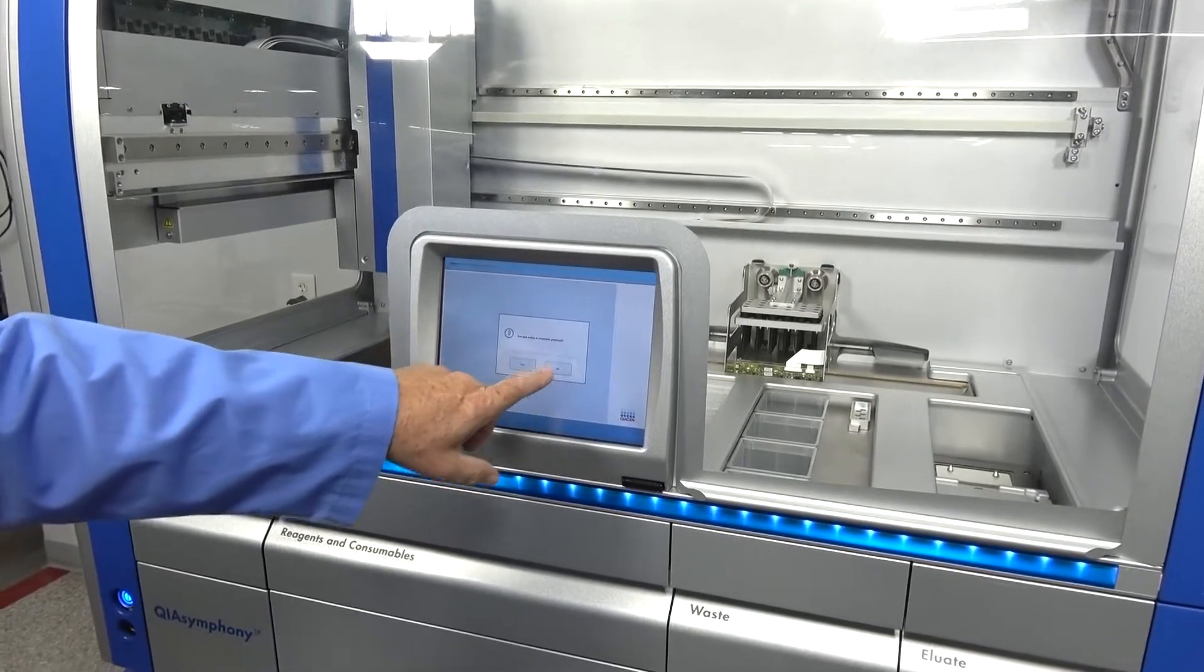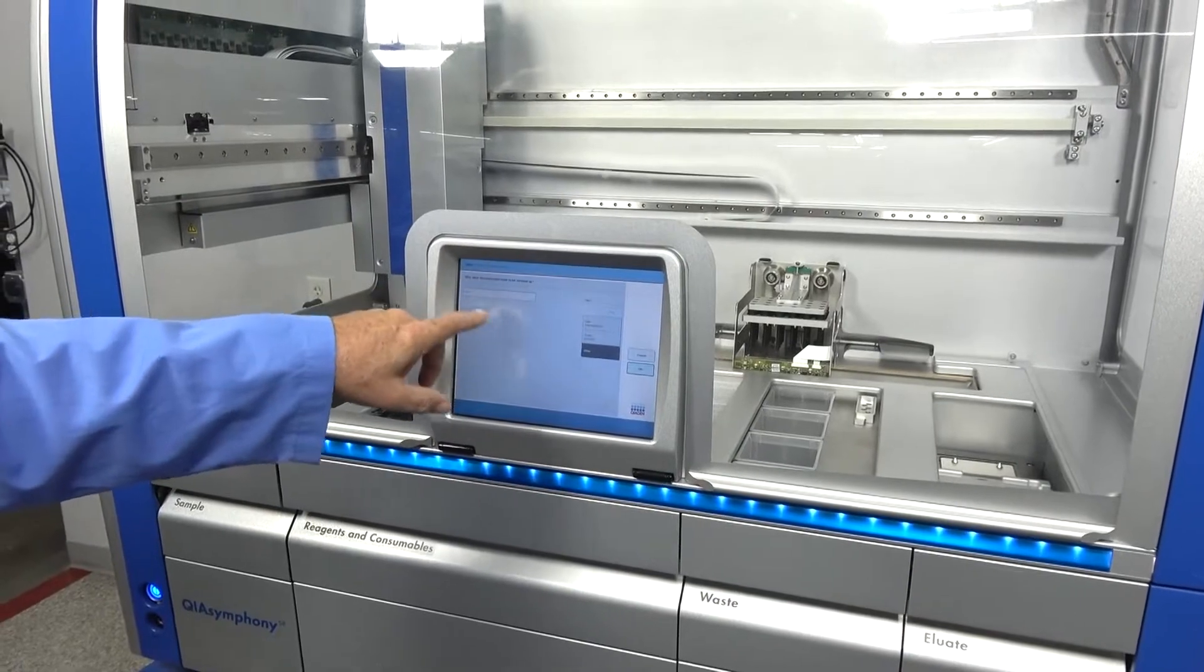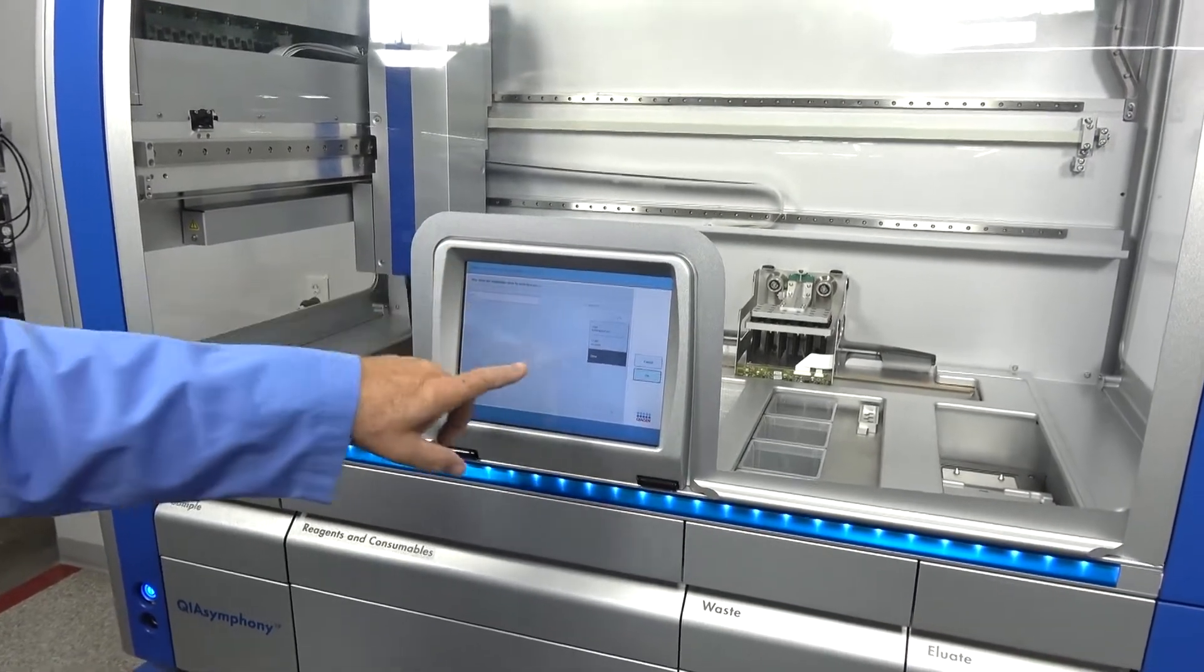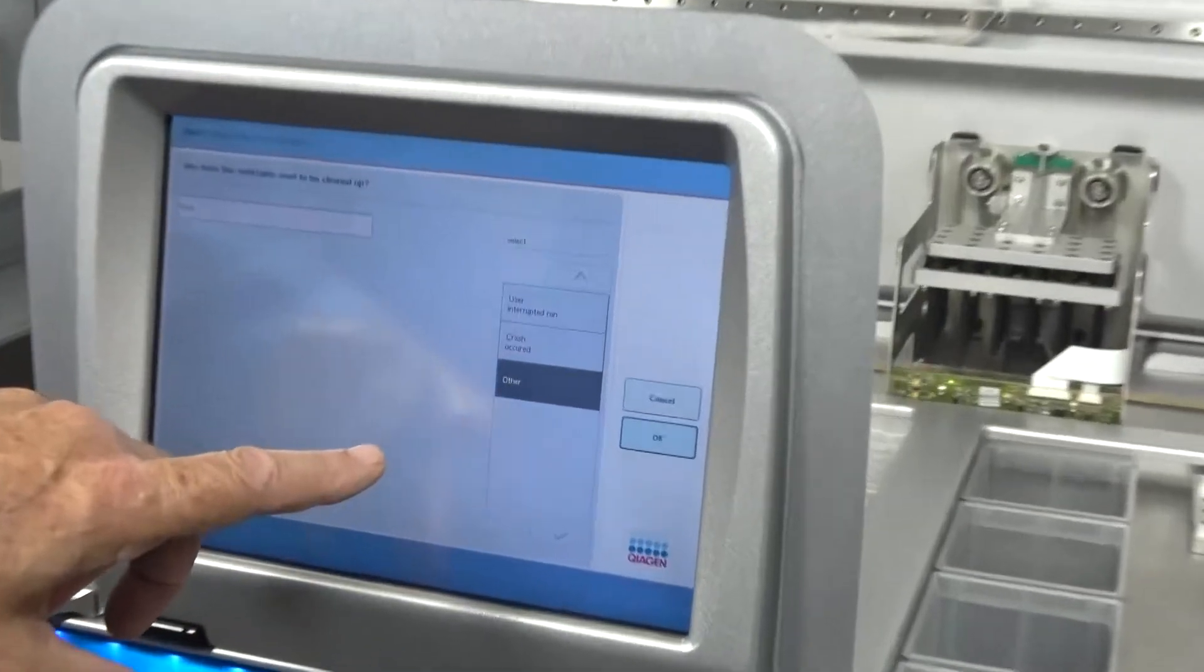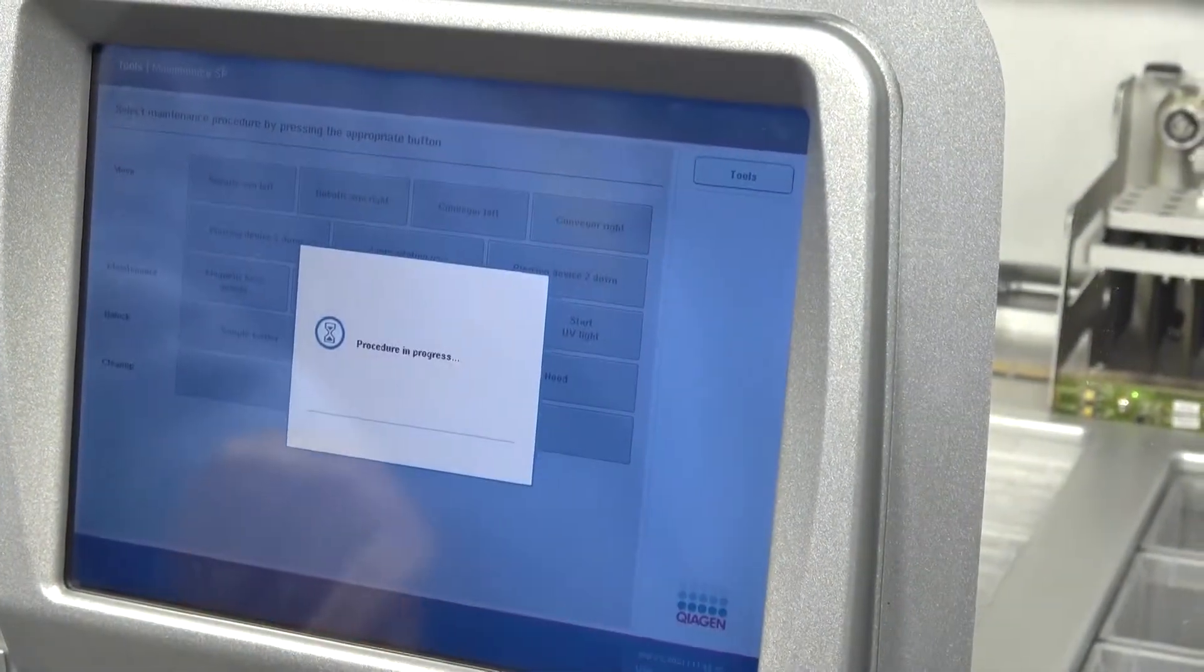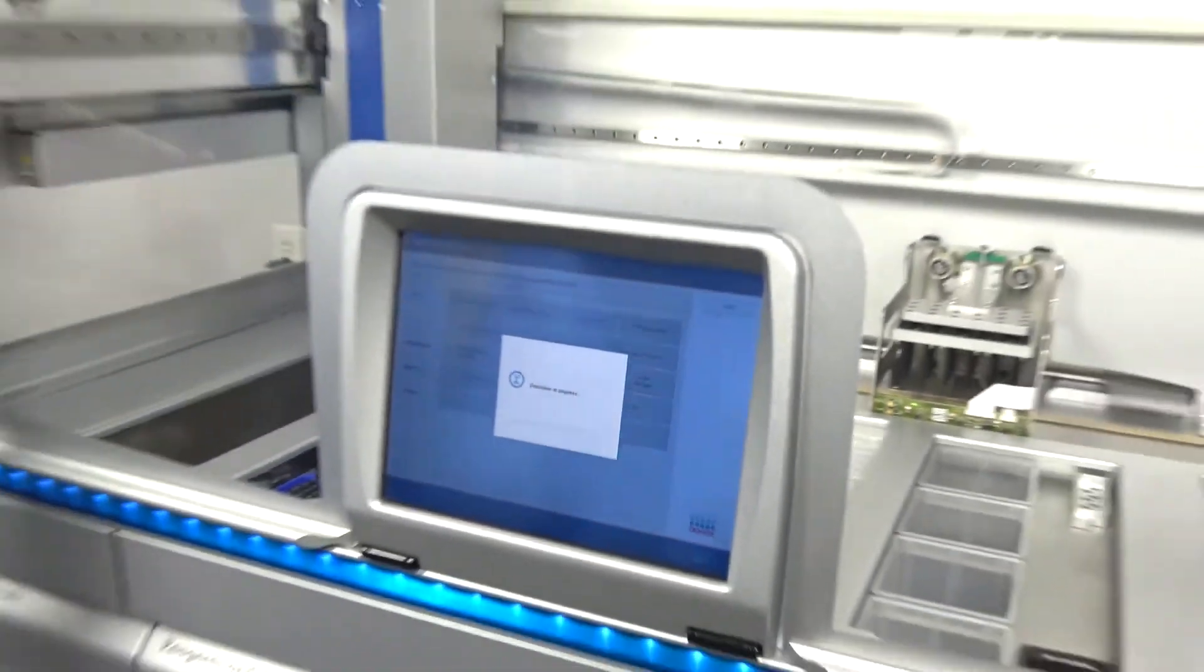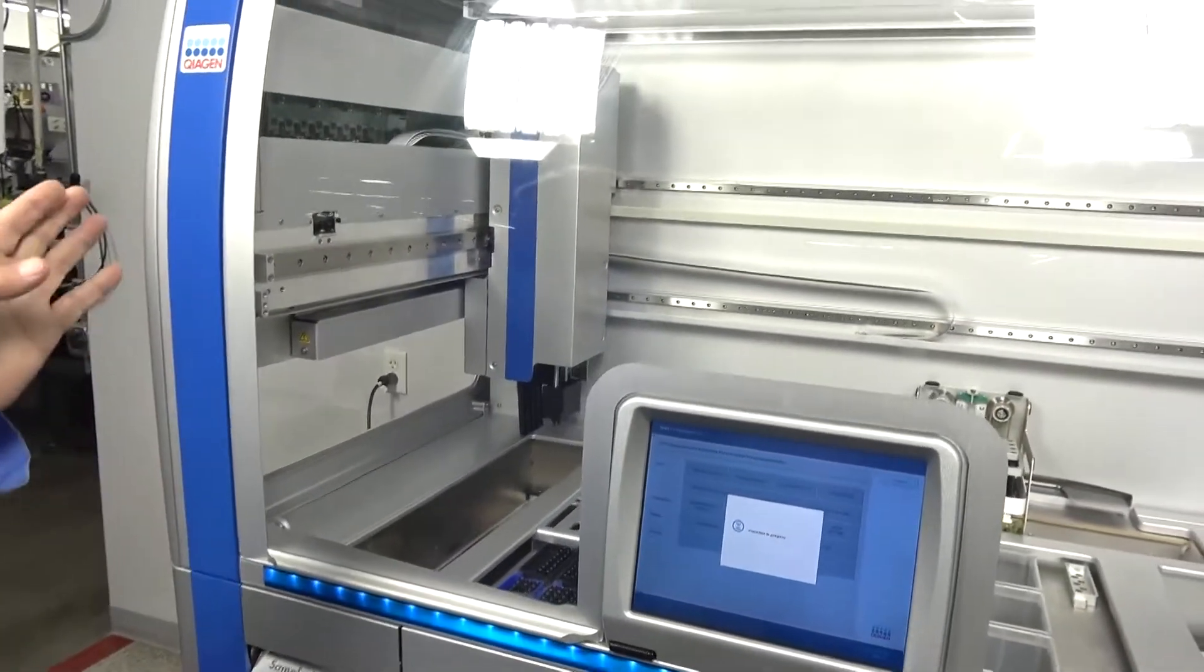Are you using casework protocol? In this case, I'm going to tell it no. It's asking why it needs cleaned up. It gives you the choices to do it. And for this test, we always just tell it other. Once that is complete, it begins its initialization process. Again, it's testing.